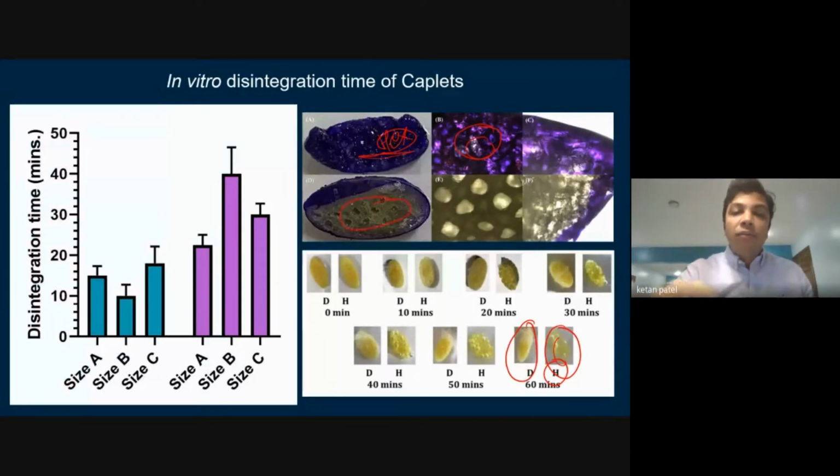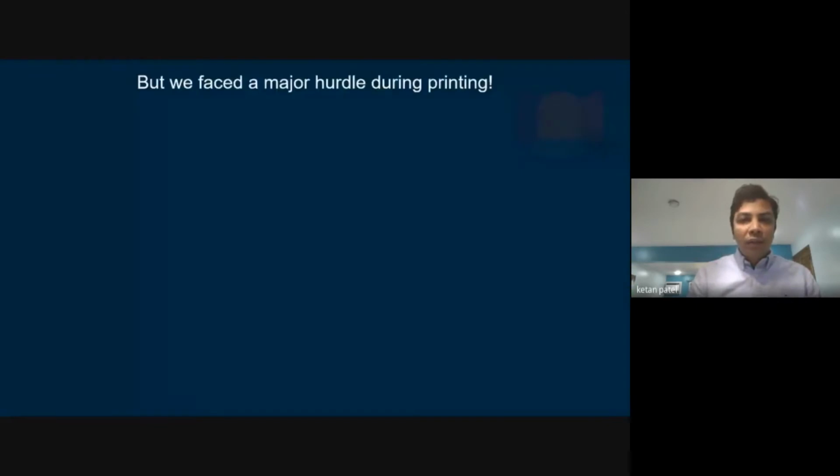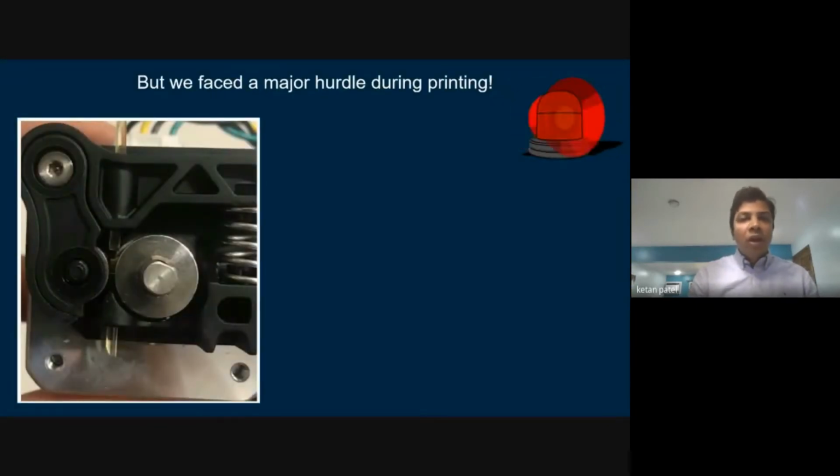And in the diamond, there is no permeation of the dye, and when you zoom in you can see there is crystal violet all over the tablet. And in the diamond, as the name indicates, the exterior is so hard, or the exterior is constructed in a way that it does not let the drug permeate inside the tablet. So with the same composition, you can make an immediate release and you can make an extended release tablet. So this is the release profile. I'll just quickly go over it considering time.